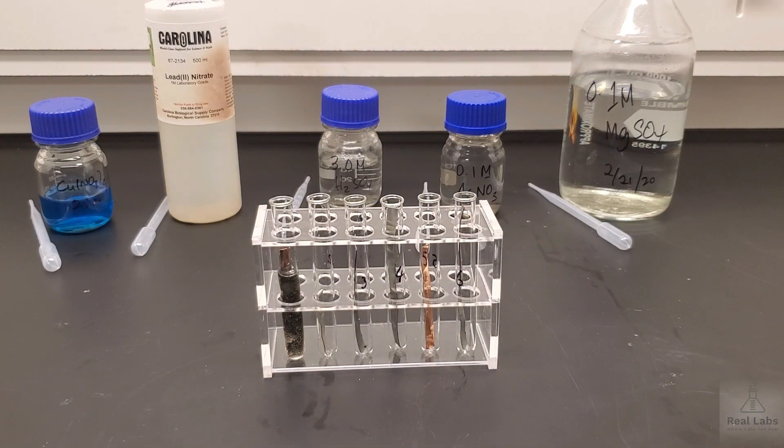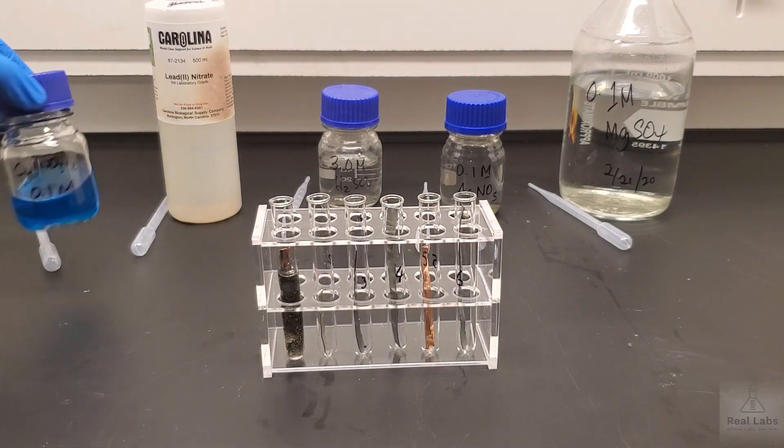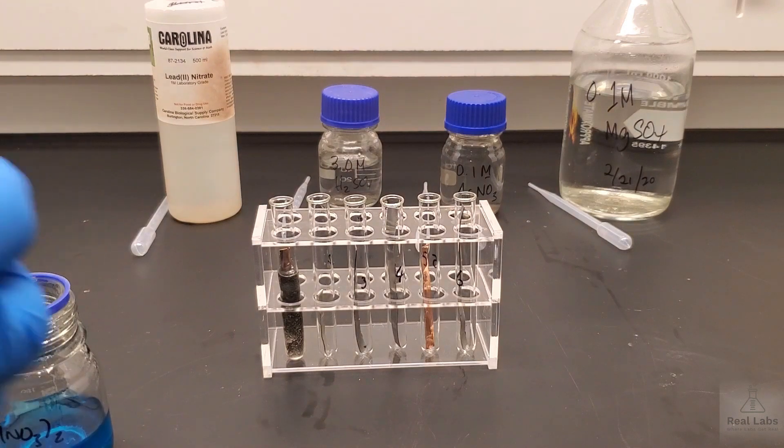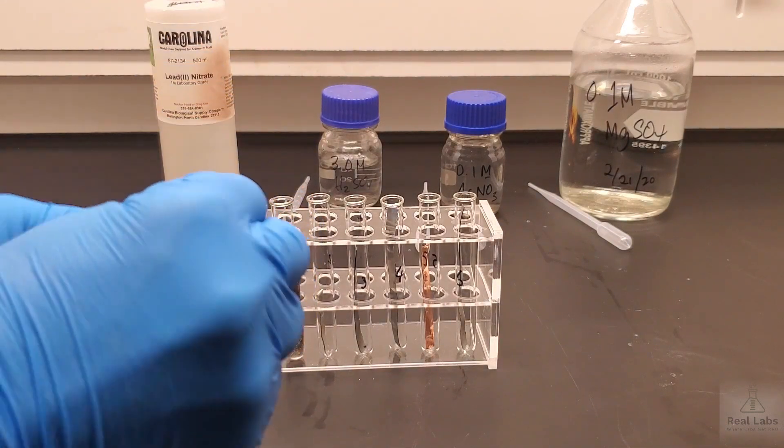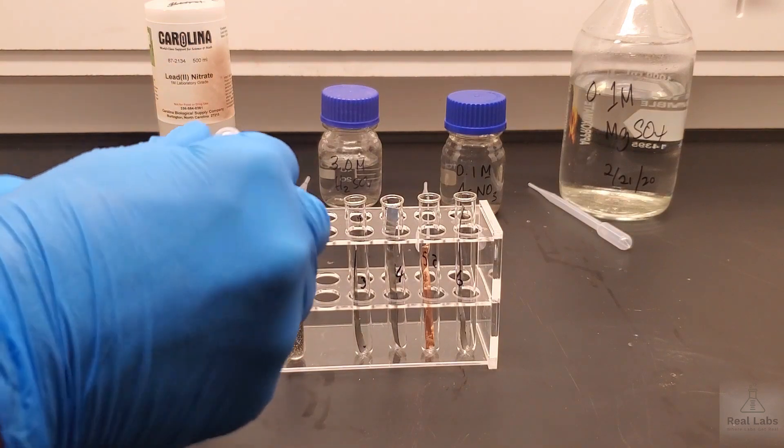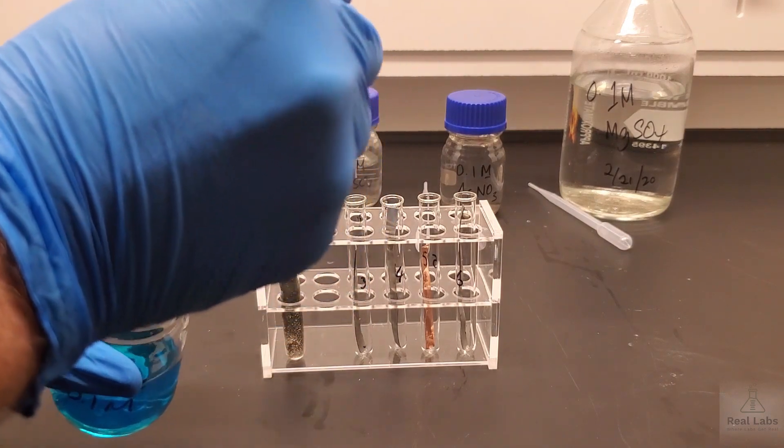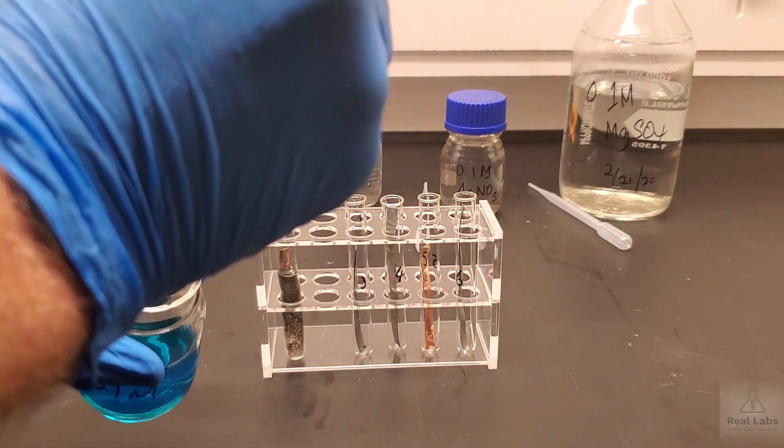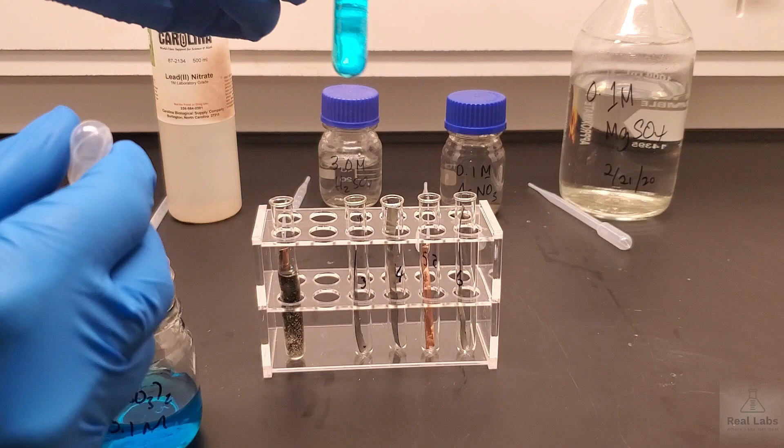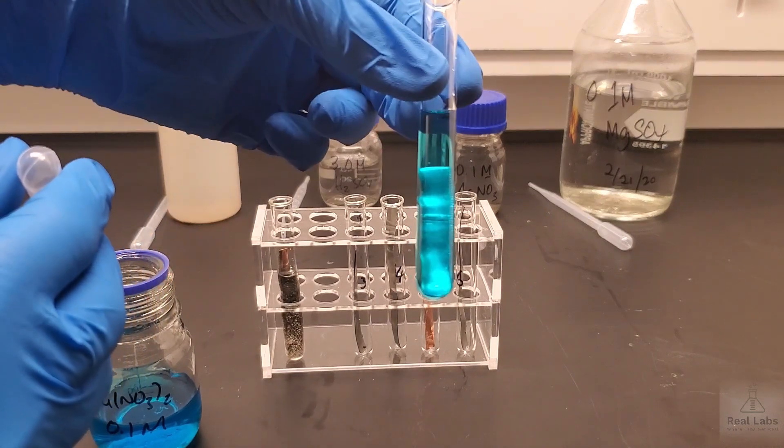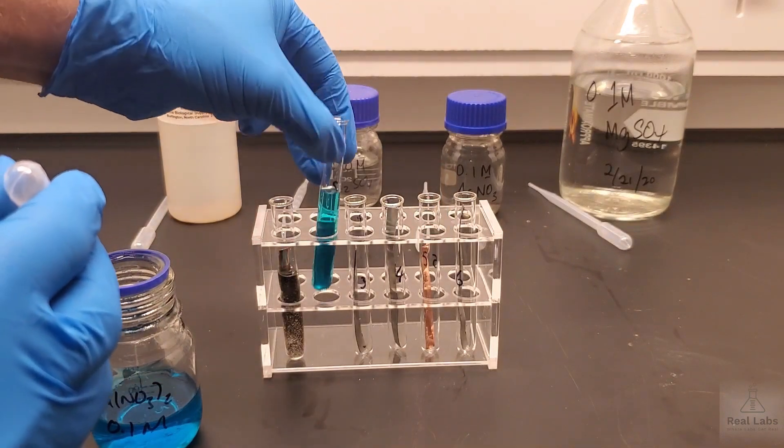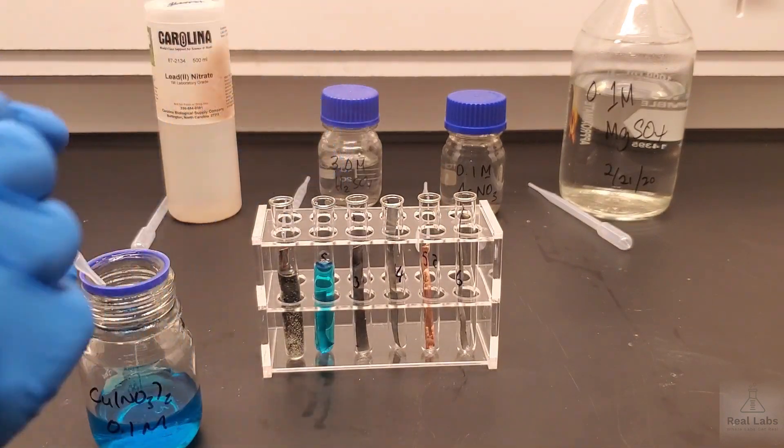In the second one where we have the lead strip, we're going to add the copper nitrate. We have our lead strip in there. We're going to fill it about halfway with this material. We can watch and see if anything happens to that. So far, it's still looking somewhat shiny in there. It doesn't look like initially anything substantial happened.